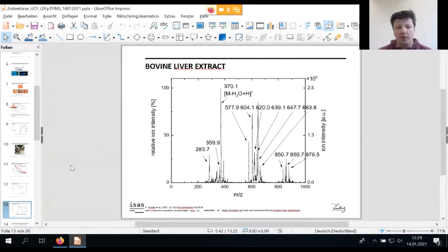Just to make that clear, we are using a very, very old ion trap here, so don't worry about the mass accuracy. It's an LCQ ion trap, not a Q Exactive or something. So the mass accuracy is not as high as with modern mass spectrometers. But you can also see some lipids at 600 masses or 800 masses, which is quite cool, because this may allow detecting different compounds in a complex sample.